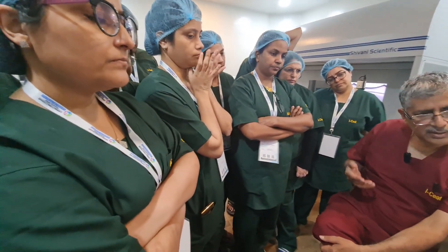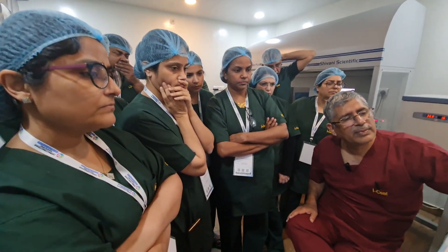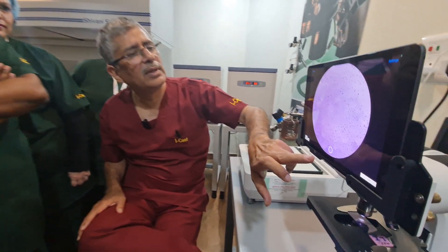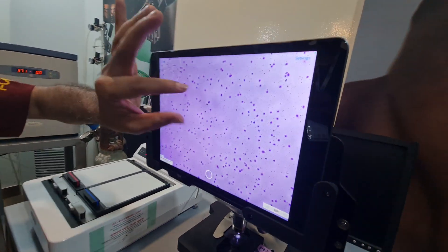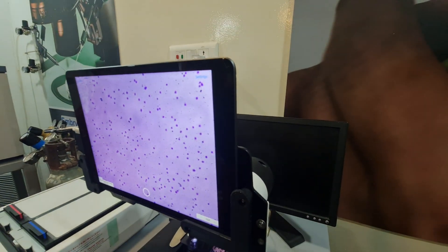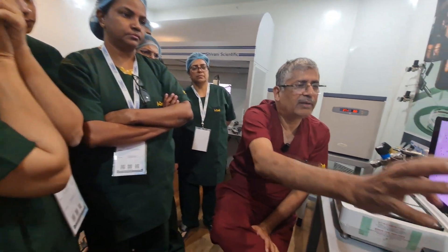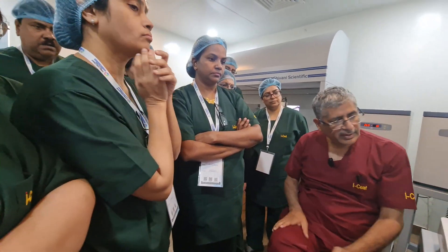For other things I need a laptop to be attached, but this is an inbuilt laptop so I can annotate and go to various things. There are multiple ways — I can circle them, take a picture. I'll take a picture and go to the settings. That's an advantage of using such a microscope. I like to give my patients a report within five minutes, so I record and WhatsApp the report. It's WhatsApp inbuilt, Wi-Fi enabled — all images just pick up and drag into the patient folder and he'll get a WhatsApp message of the report.